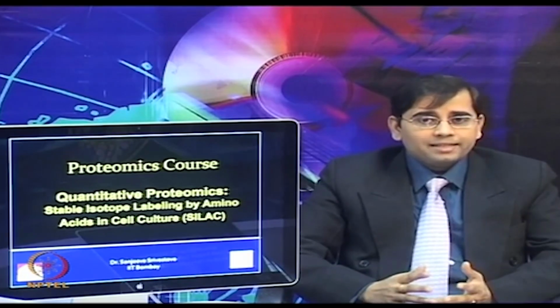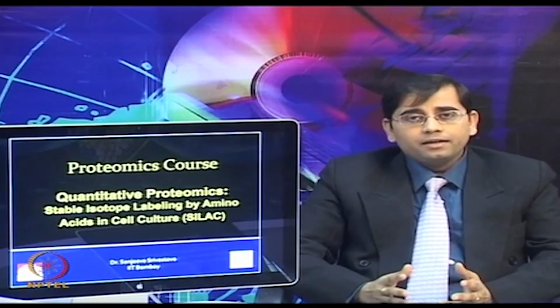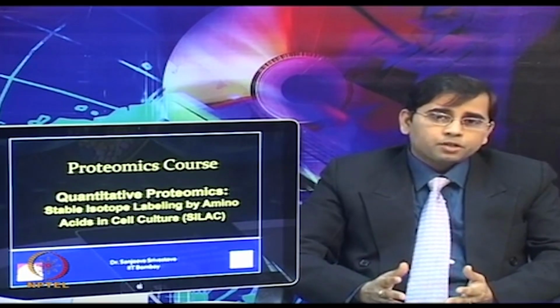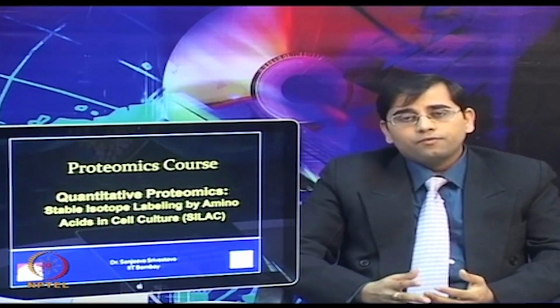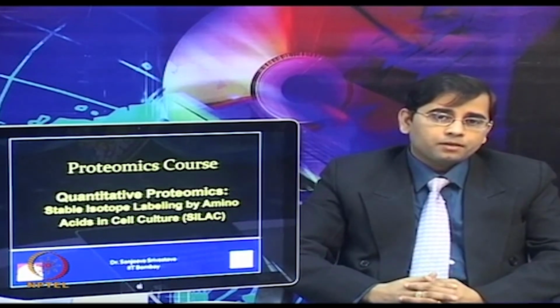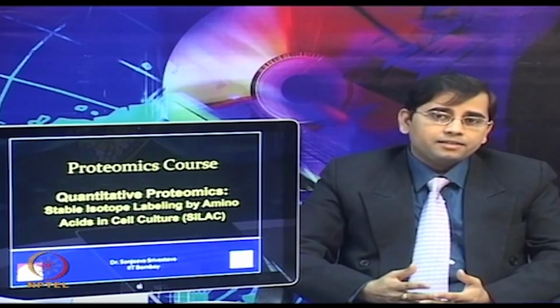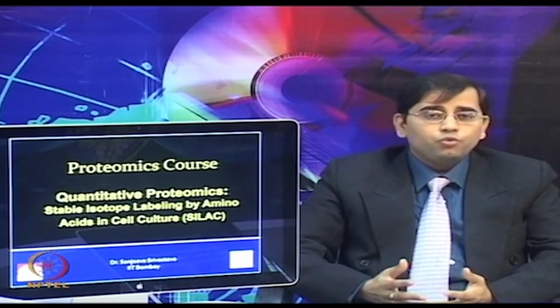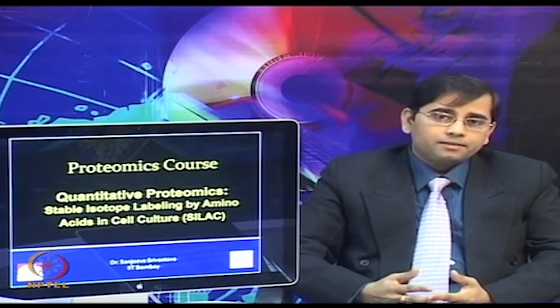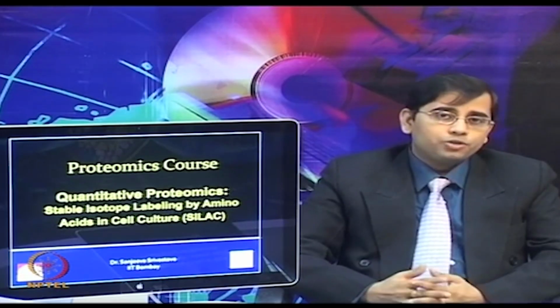However, MS is not a quantitative technique to begin with, and peptide ionization efficiency is unpredictable. So, the usefulness of this data for quantitative purposes remains limited. Many advancements in MS during the last decade have provided new ways for protein analysis and facilitated the proteomic analysis of various biological systems.